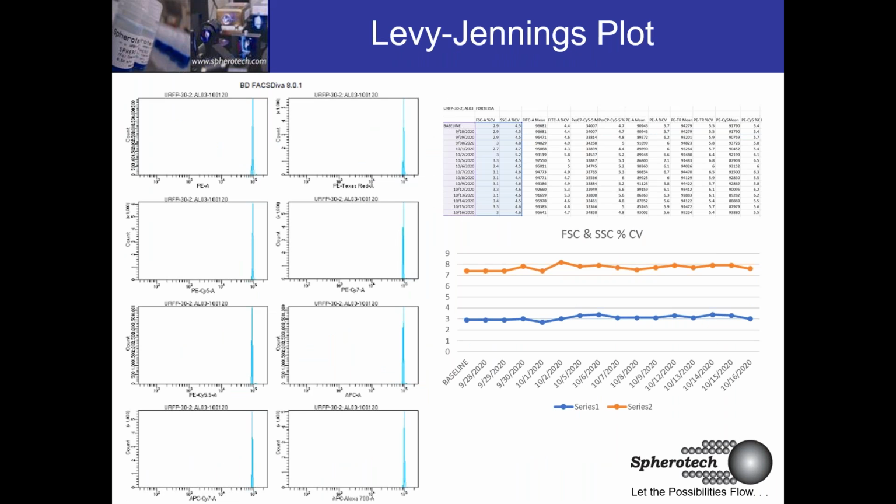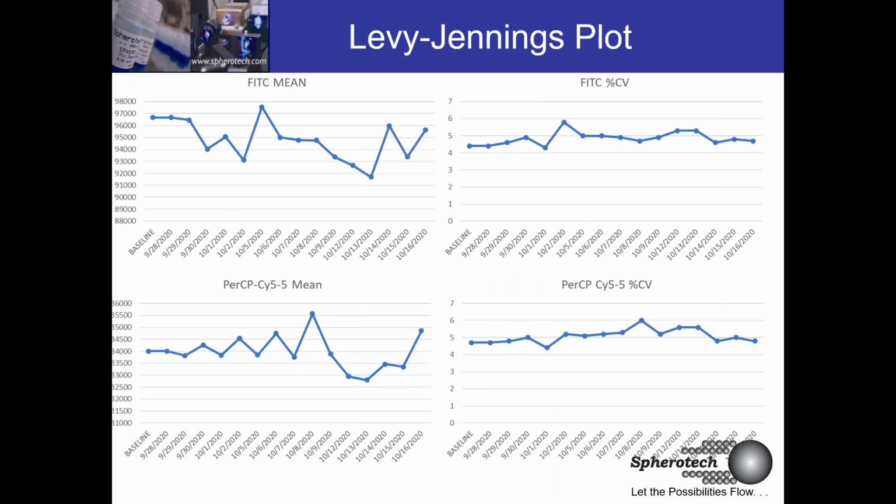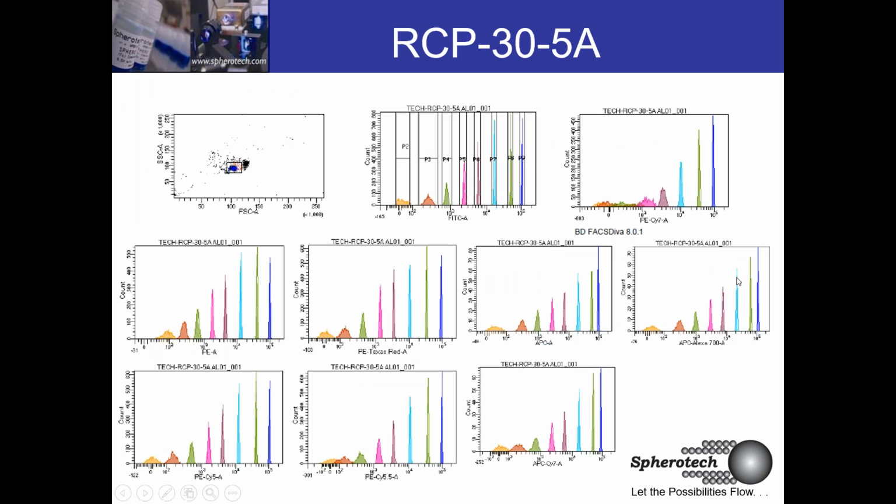So this is really the power of the alignment particle, is determining your day-to-day health of your instrument, making sure that it can see something very precise. Next, so this is more about precision. Next, we're going to focus on accuracy, and that is its ability to tell or differentiate between different brightnesses, right?